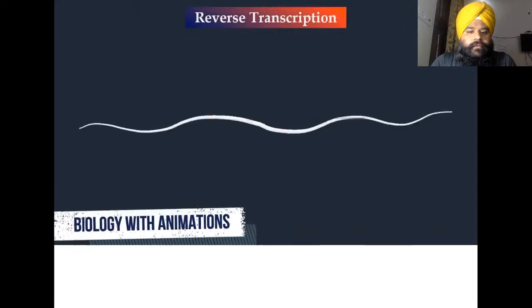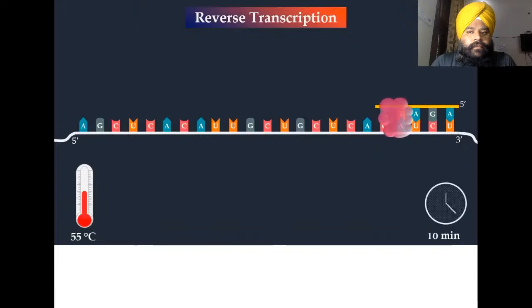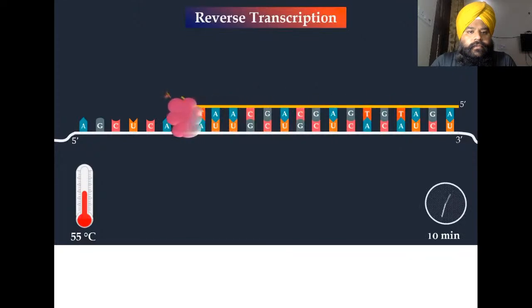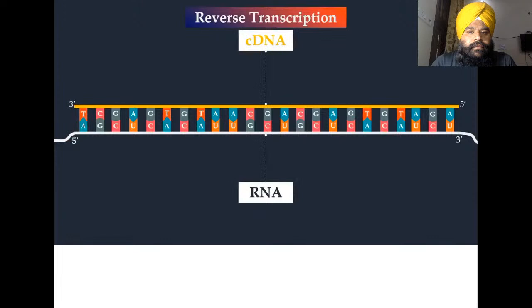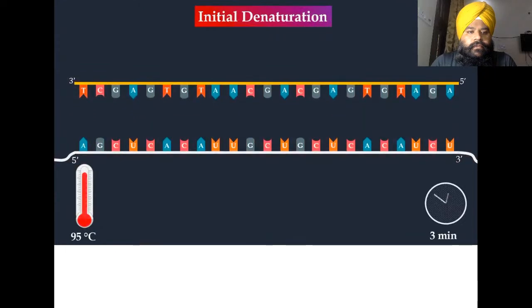The first strand complementary DNA synthesis is primed with the PCR reverse primer, which hybridizes to a complementary part of the virus RNA genome. Reverse transcriptase then adds DNA nucleotides onto the 3' end of the primer, synthesizing DNA complementary to the viral RNA. The temperature and duration of this step depend on the primer, the target RNA, and the reverse transcriptase used. Next, an initial denaturation step is applied, causing denaturation of the RNA-DNA hybrids. This step is required for the activation of DNA polymerase and simultaneously the inactivation of reverse transcriptase.